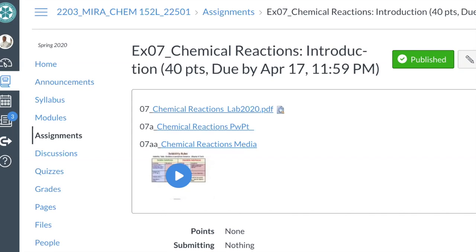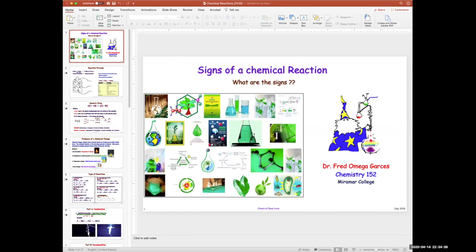Okay. So what you guys are going to be doing is carrying out a reaction. You are going to make careful observations on that reaction, and hopefully you can get an appreciation for writing chemical reactions.